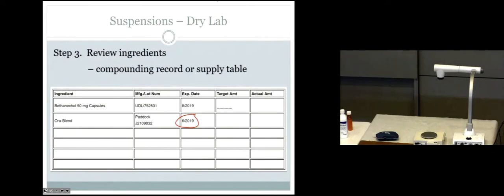Why is that? Why do we only put 14 days on it? It's got water, and what does water do? It does 2 things. It can break down the drug. It could cause hydrolysis. We have no idea how stable our drug is in water. It started as a powder, which is stable, but you put something in water, you have no idea how quickly it's going to break down.